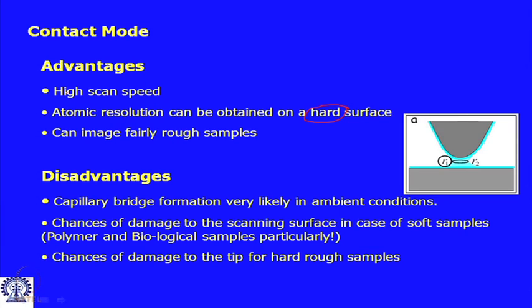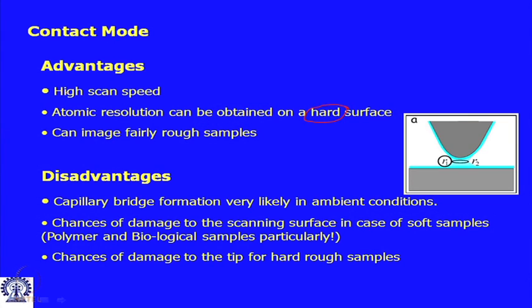And this, of course, is not written in the viewgraph, you must remember that this provides the best lateral resolution, or as it is already written there, that it is possible to achieve atomic resolution. But even other than that, even with a routine atomic force microscope without vacuum and anything, seeing a lateral feature of 3-4 nanometer, a quantum dot or a nanoparticle, is pretty routine using contact mode imaging.